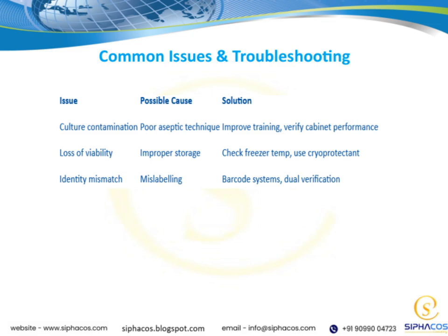If the issue persists, consult the troubleshooting guides or FAQs, which often cover the most common problems. Remember, systematic troubleshooting helps you narrow down the root cause without unnecessary guesswork. Also, don't forget the importance of documenting any recurring issues, so you can look for patterns and prevent future problems. Connecting these troubleshooting steps to our overall theme, it's about maintaining smooth operations and minimizing downtime by being proactive and methodical. Staying calm and focused when issues arise is crucial for effective resolution.